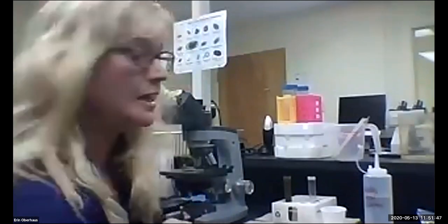But in the first fecal I did this morning, I found some roundworms, which was interesting because we have a pretty healthy adult herd. We do have some younger pony crosses, so it's possible that it came from a younger horse, or maybe we have a horse out there that has some Parascaris. Unfortunately, I don't know which horse it was, so I'd have to do all 25 of them to figure out who that actually came from.